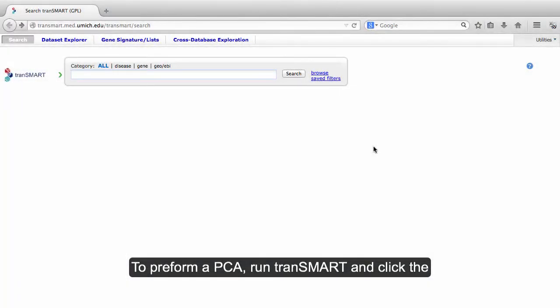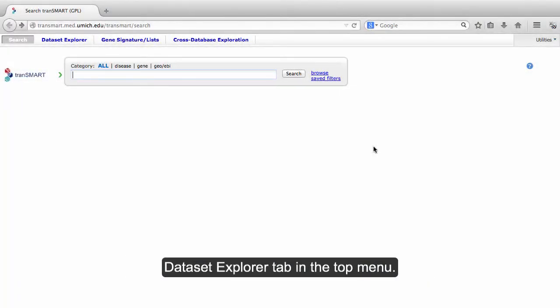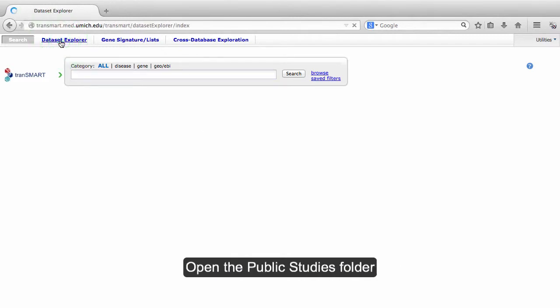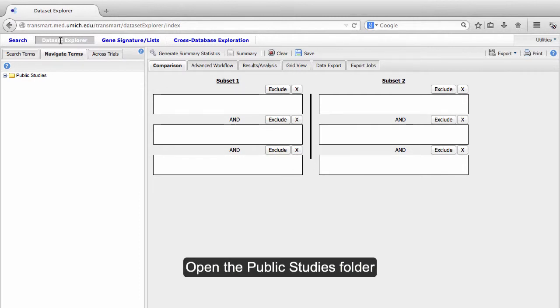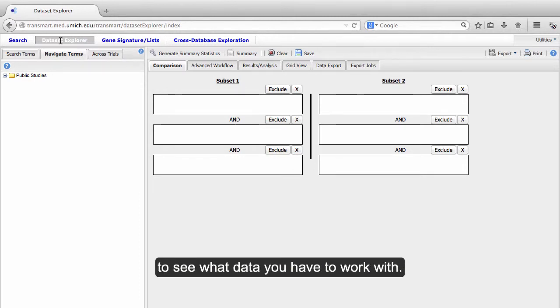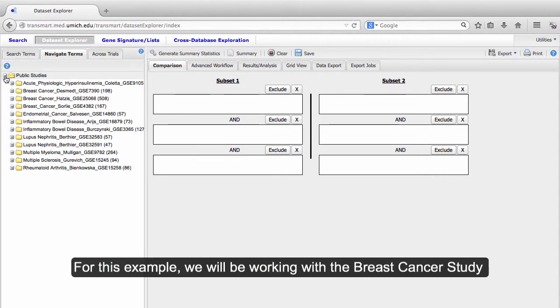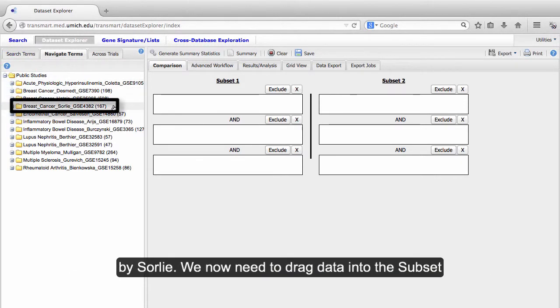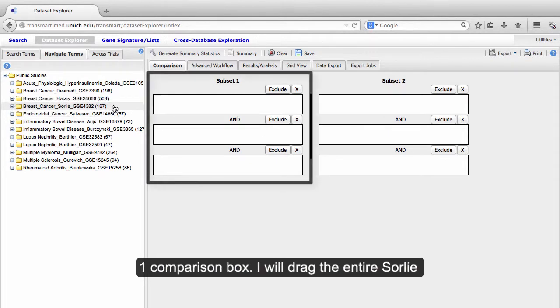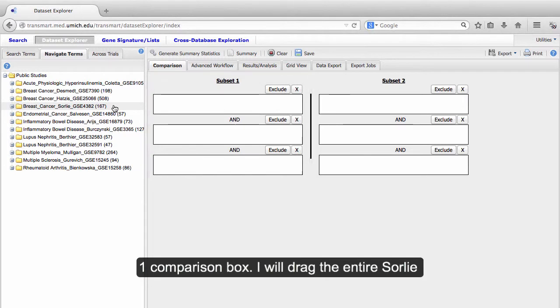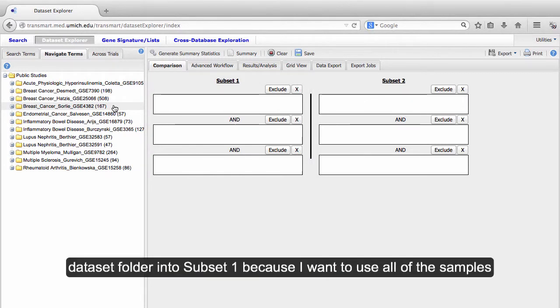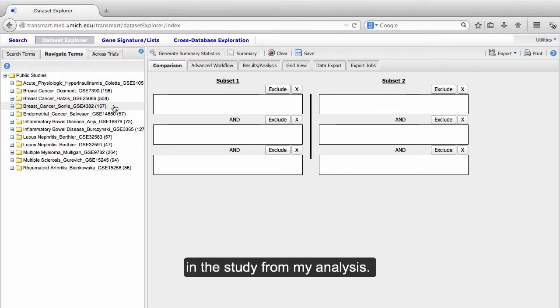To perform a PCA, run Transmart and click the Dataset Explorer tab in the top menu. Open the Public Studies folder to see what data you have to work with. For this example, we will be working with the Breast Cancer Study by Sorlie. We now need to drag data into the Subset 1 comparison box. I will drag the entire Sorlie dataset folder into Subset 1, because I want to use all of the samples in the study for my analysis.